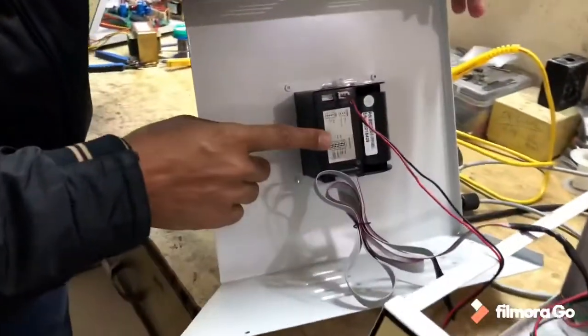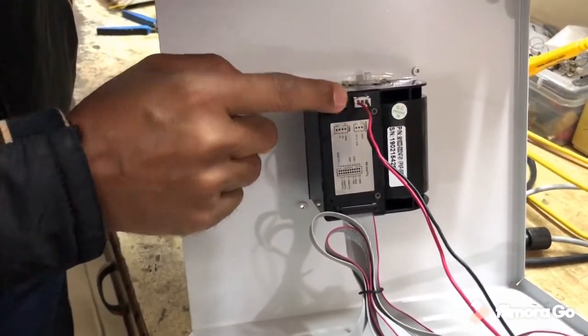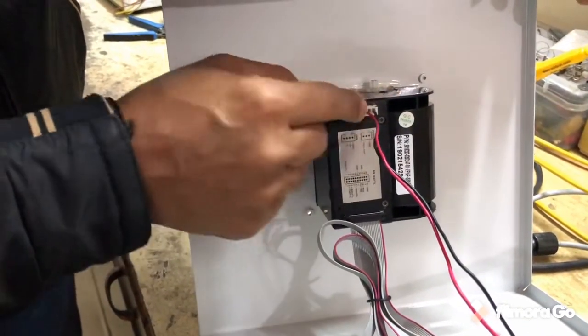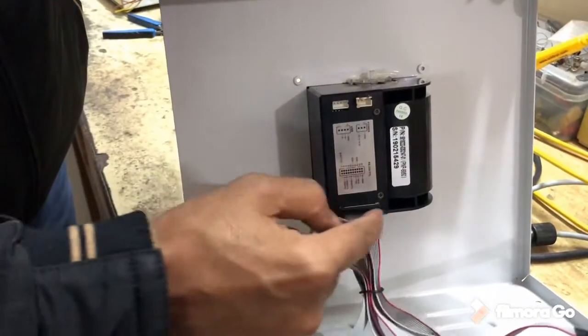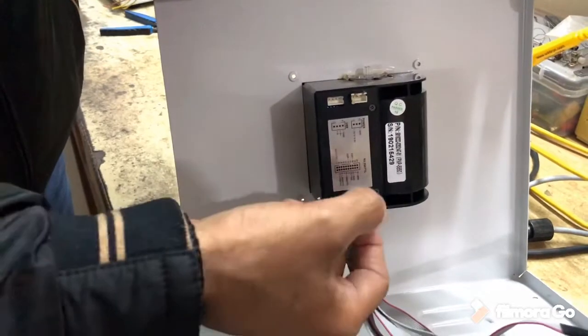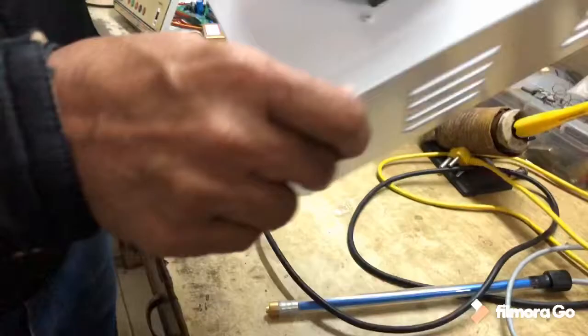Now you can see in the printer portion there are only 2 connectors. One is a power connector and it is a 2-pin connector. Another is a 20-pin connector. You have to plug both of these out. After plugging them out, this panel is now separate.